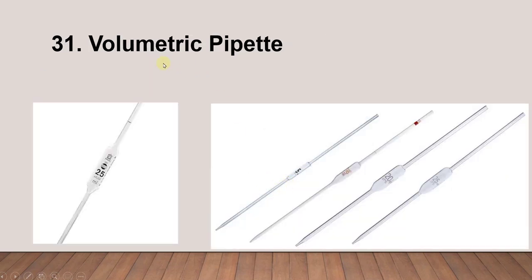Next is the volumetric pipette. As you can see, each volumetric pipette delivers a constant volume — 5, 10, 20, or 25 ml. All of these are called volumetric pipettes.